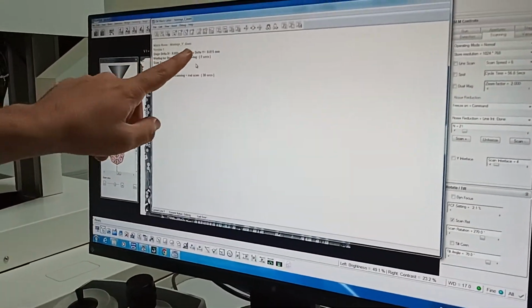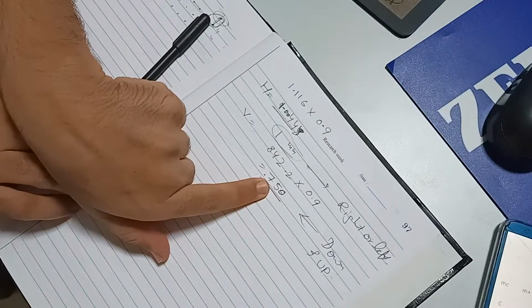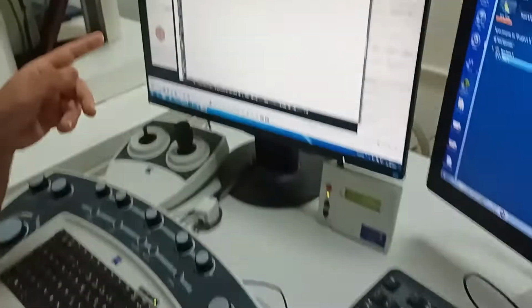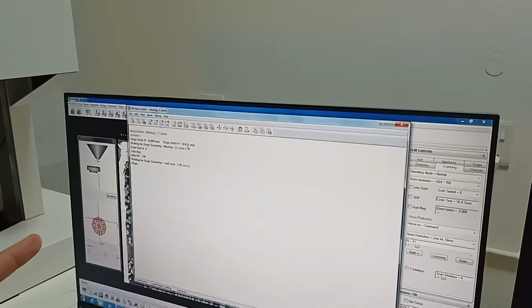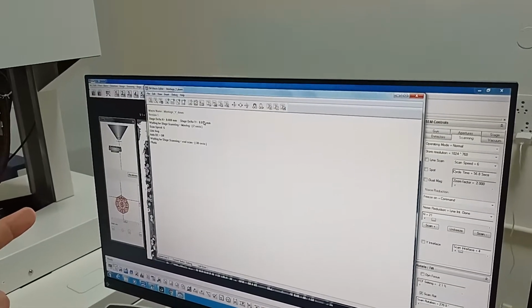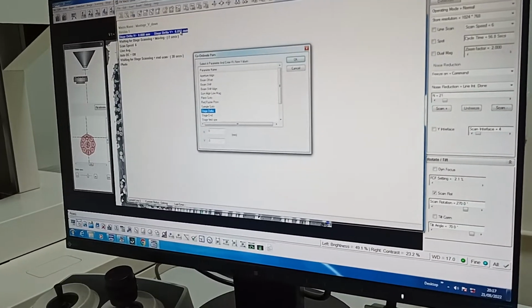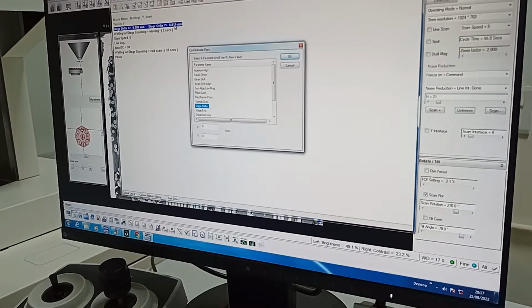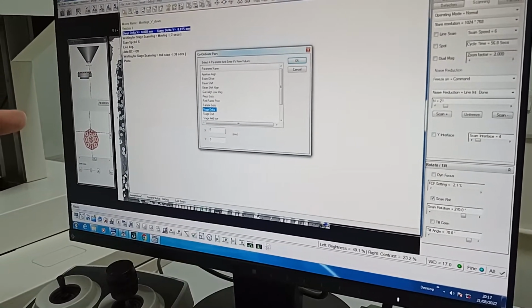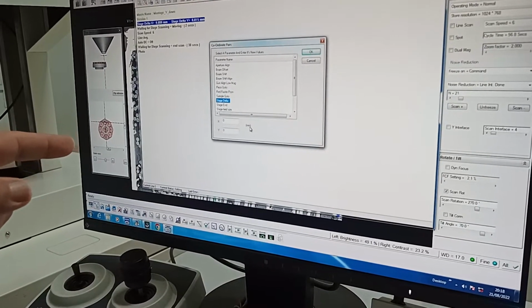So this is montage down. Which value will we need? This one. At this moment we don't have to worry about sign because we are going to test this macro, where it is moving. So let me edit this value. I have double clicked on this line. X is 0. By default the unit is mm. So here in mm it means 0.75.